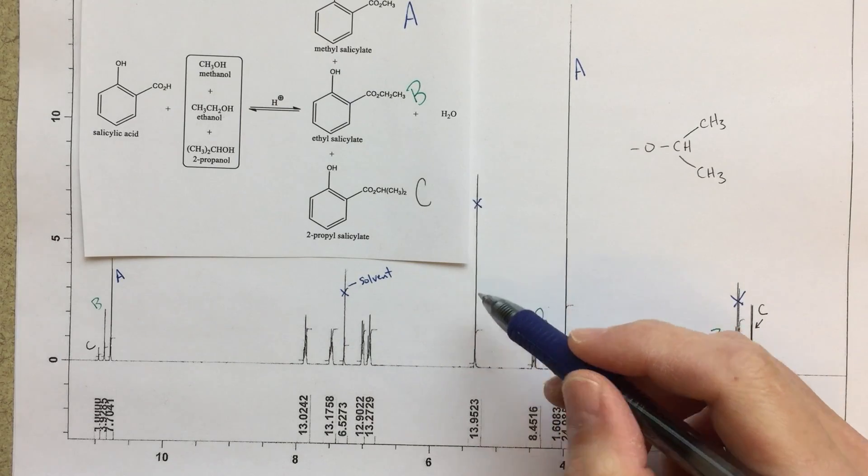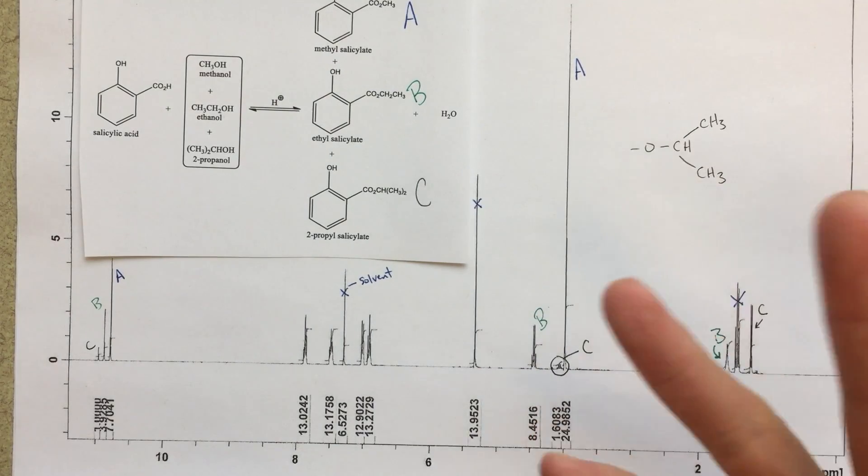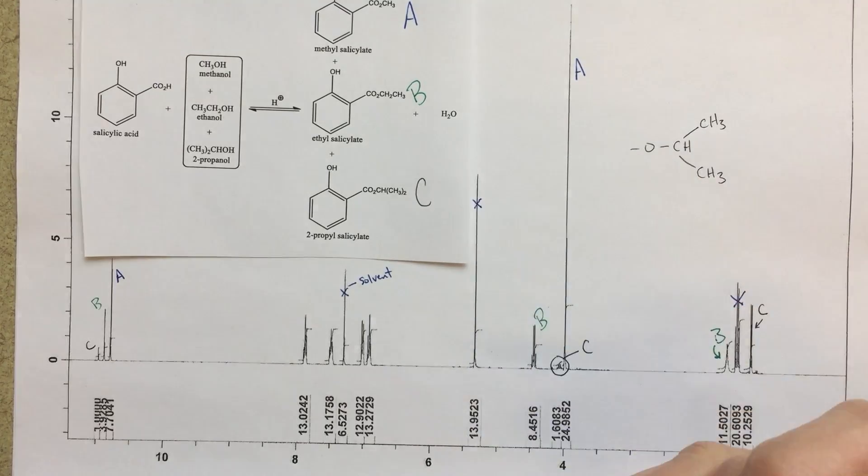I think that we can still solve the problem. We can still do the calculations we need to do. But this peak here, I don't have a good explanation for. This peak here, again, I was told it was DCM. It could be, I guess, but the chemical shift where it's coming at does not exactly make sense for DCM. So I'm, again, a little bit hesitant about that as well. But in any case, the next part of the question says, can we find the percent, the relative percents of each of our products?